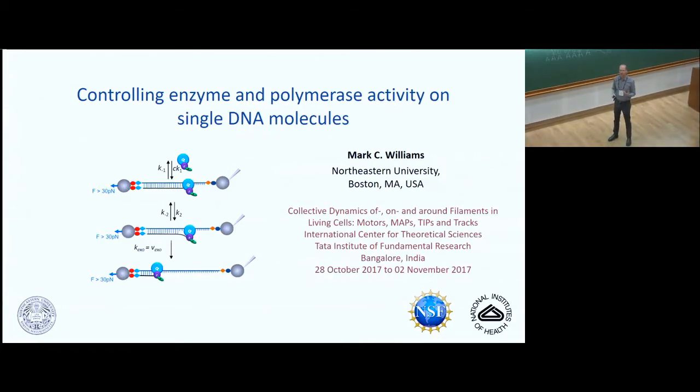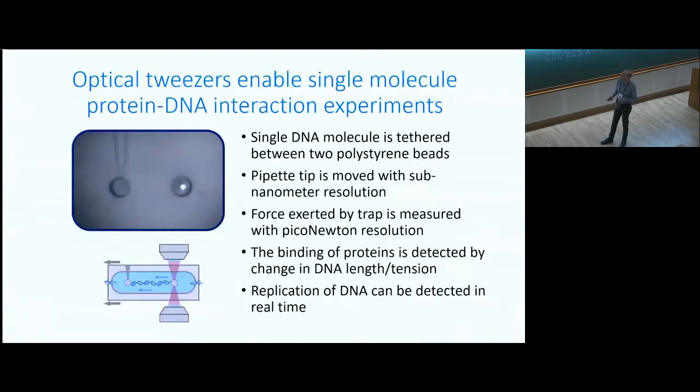So the last talk we saw beautiful imaging looking at the dynamics of proteins. I'm going to talk about how we're going to try to feel the dynamics of the proteins using forces. It'll be two different stories, one about E. coli replicative DNA polymerase, and another about HIV replication, both of which are really related to things going on tracks and encountering obstacles. Let me just start with the basics.